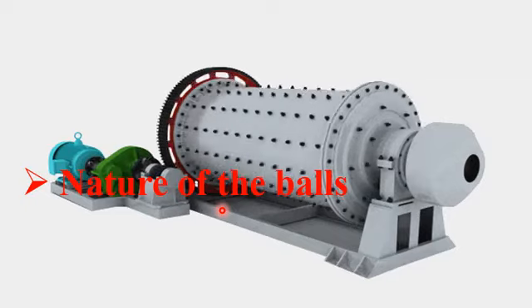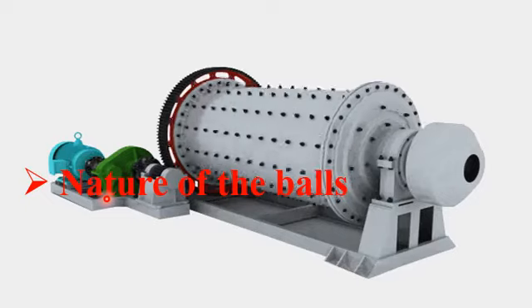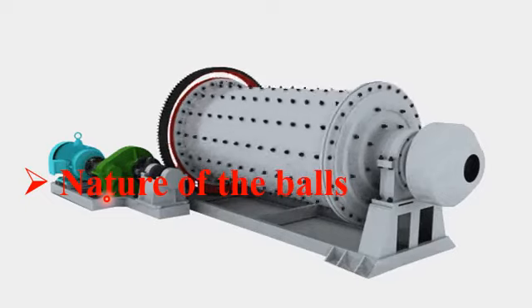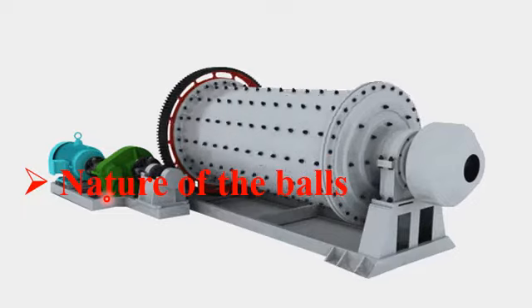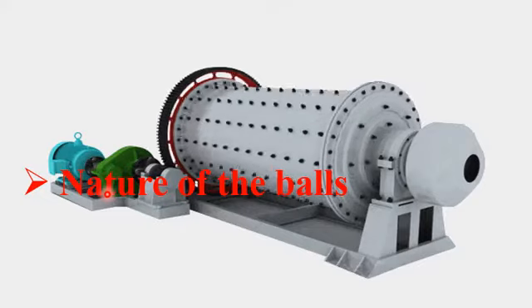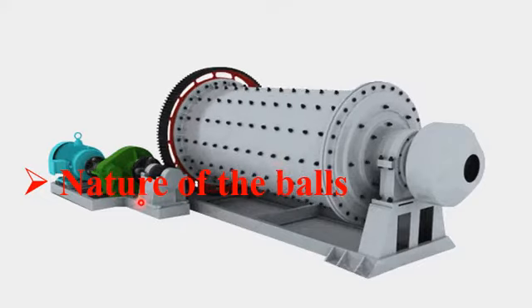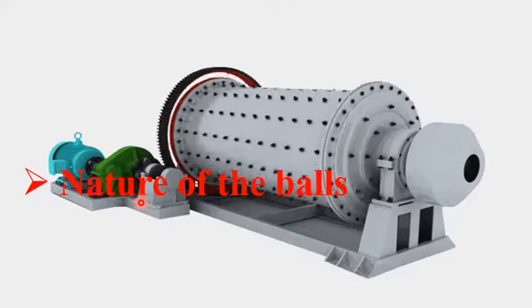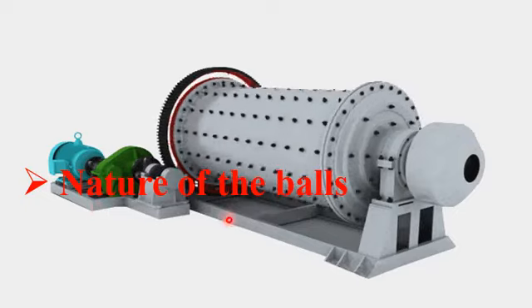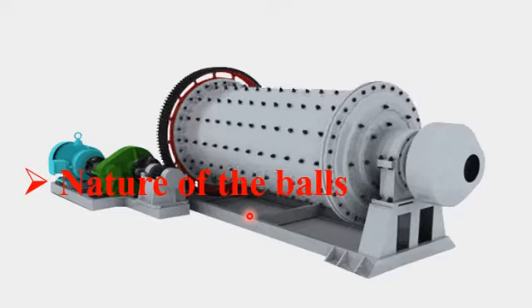In case we want to crush a harder material, tungsten balls or even hard metal balls are used to crush very hard metals or very hard materials. Please note that the balls used will depend on the nature of the bulk material which we want to crush.